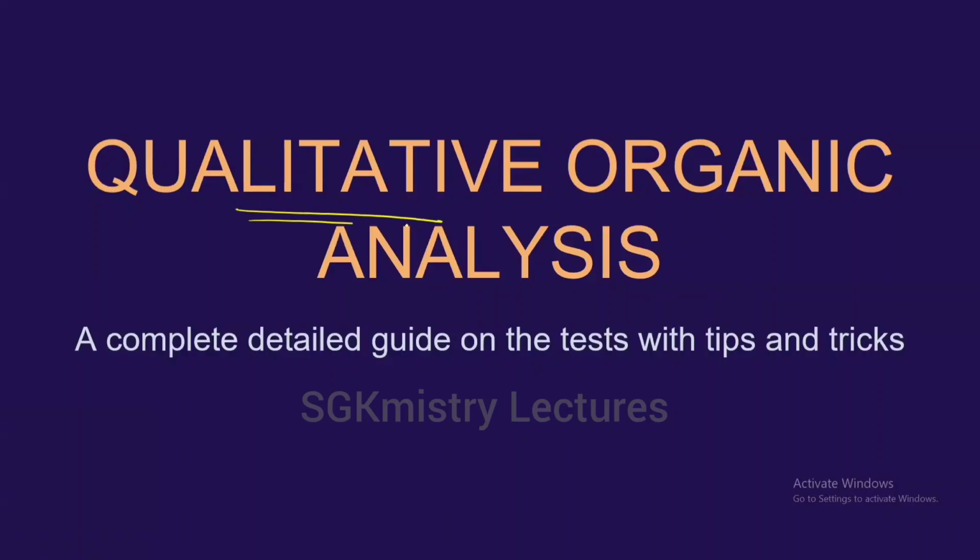In this video, I'll be explaining the entire experiment of qualitative organic analysis, in which I'll be explaining in detail each of the steps, starting with preliminary examination, then the determination of physical constants, detection of elements, solubility test, and even how to find out the various functional groups, the various tests that need to be performed, along with the positive as well as the negative results of each of them, and also how to prepare the derivatives for the organic compound that is given to you.